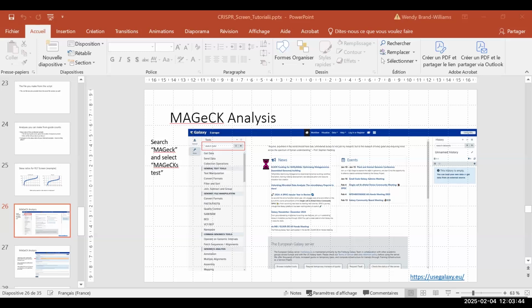The next thing we need to do is just to upload the text file you guys downloaded from the cloud. And to do that, I click on single data set. Then you see next to it, there's 3 dots.